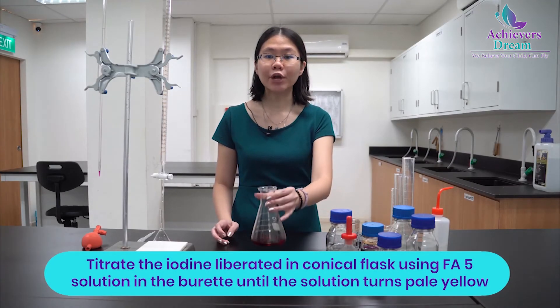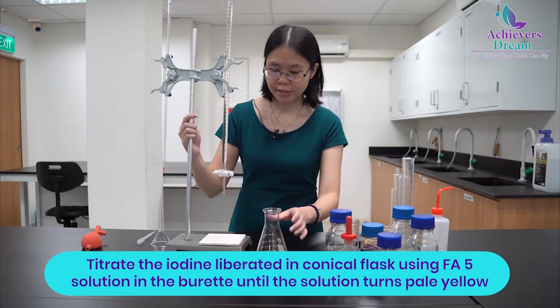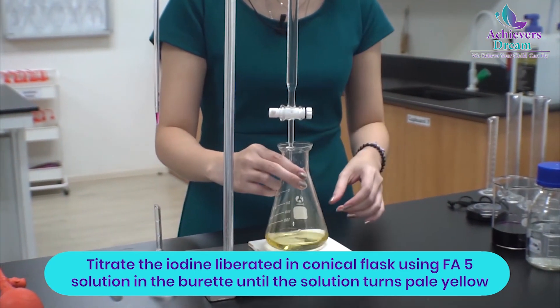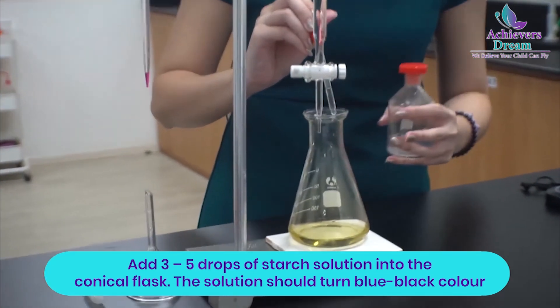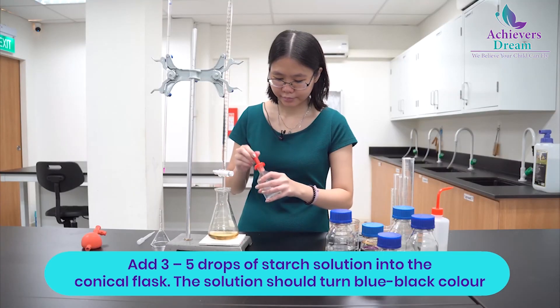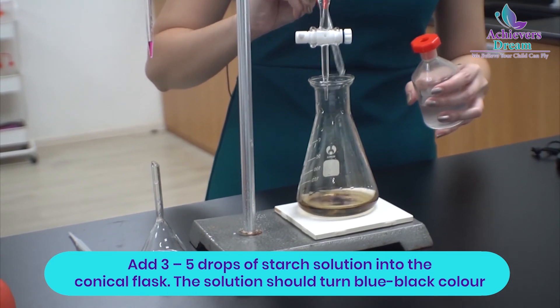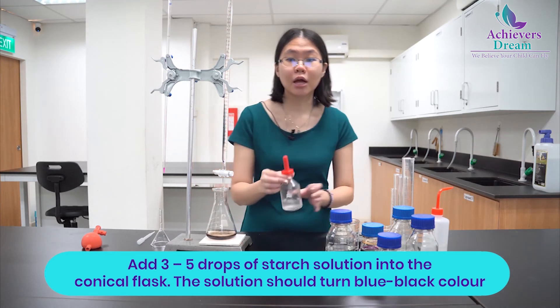Then titrate the liberated iodine with FA5, which is your sodium thiosulfate, until the colour of the solution turns pale yellow. Then add around 3 to 5 drops of starch indicator into the mixture inside the conical flask. The solution should turn blue-black at this point.